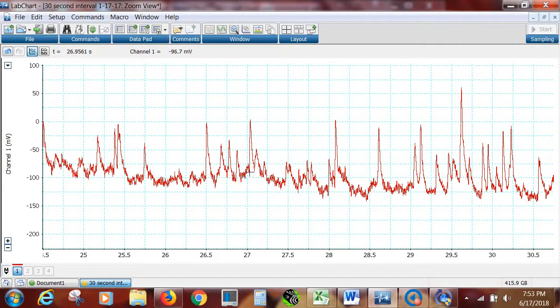Oh, so that's 1, 2, 3. And this one's kind of started and it really fell in there. So that's really 4. Let's do that as 4 then. And then 27 to here. Well, we already counted that. So what do we got here? Maybe 1, 2. That one's after that. So we'll go to 28 as 2. 28 to 28.5. 1, 2. 28.5. 2. Okay, so you get the idea.